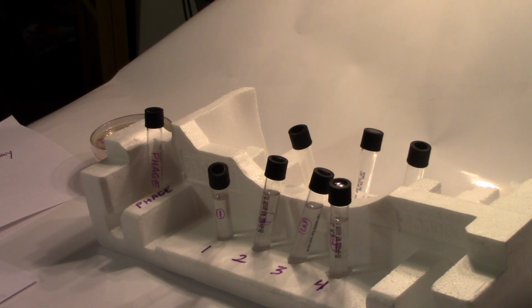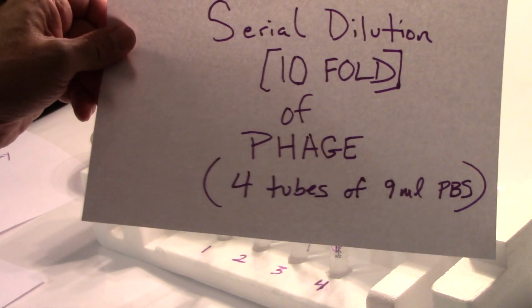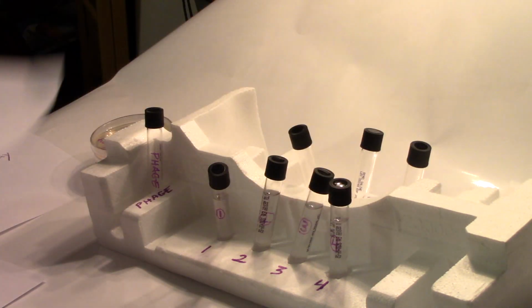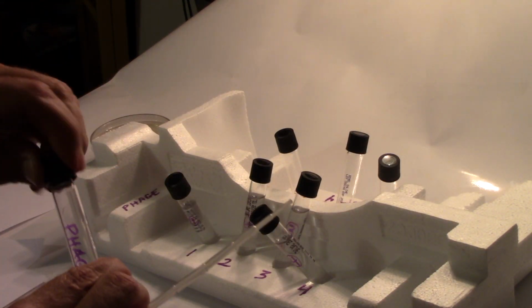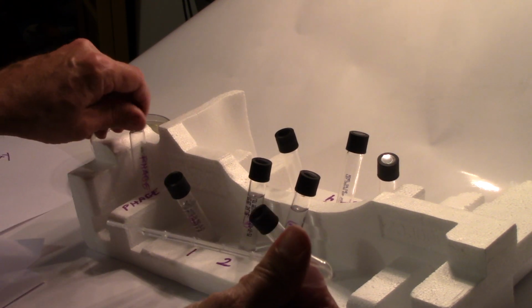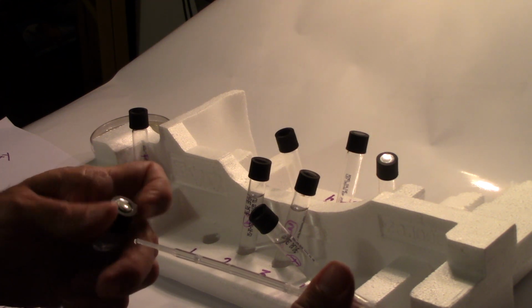1 part of the phage to 9 parts phosphate buffered saline. You can see here we're going to be using a 10-fold serial dilution of the phage, 4 tubes with phosphate buffered saline. So I'm going to take my phage, I'm going to take 1 ml of the phage. I'm going to mix it into tube 1.